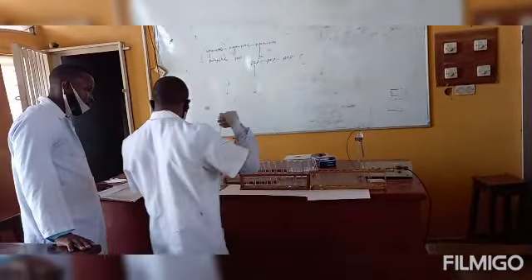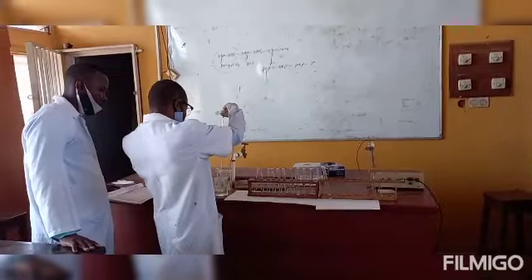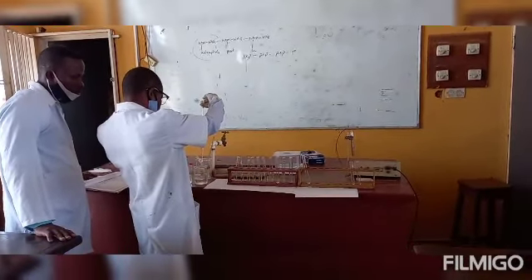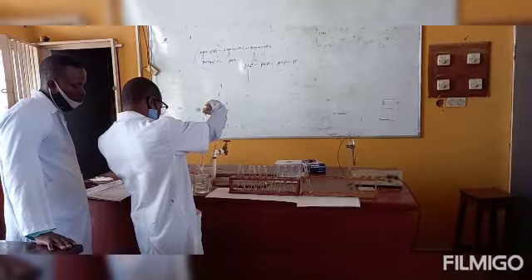As you can see, Mr. Peter is preparing it using the pipettes accordingly. To test tube 3, you add 3.74 ml of water, while to test tube 4, you add 3.23 ml of water.